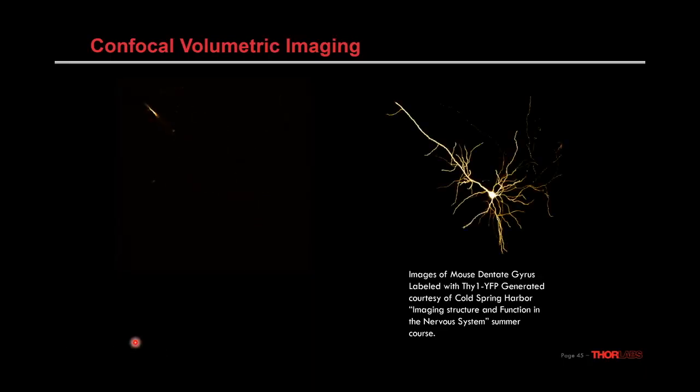So now by stepping through a Z-stack and taking images at various points along the Z-stack, you can then reconstruct a 3D image that looks perfectly in focus because we've excluded all the out of focus light and stepped through a 3D structure.